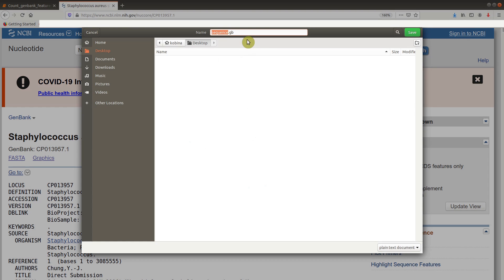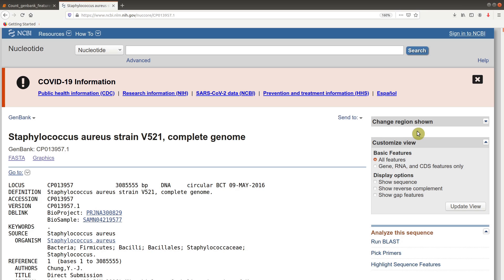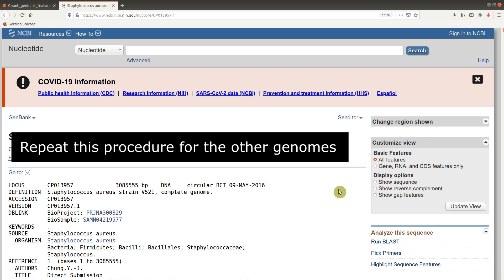It gives you a default name, but I will change it because we have multiple files to download. So this one becomes VIN 521, because that's the name of the strain. I will save it on my desktop. Please follow these instructions for the four remaining GenBank files and get them all downloaded to a location of your choice.